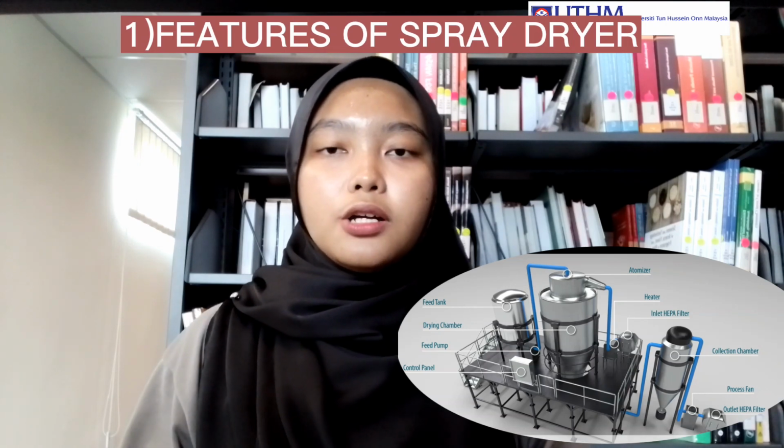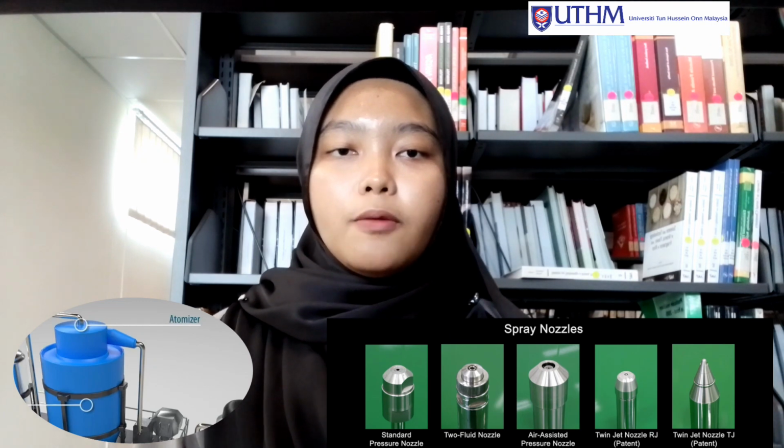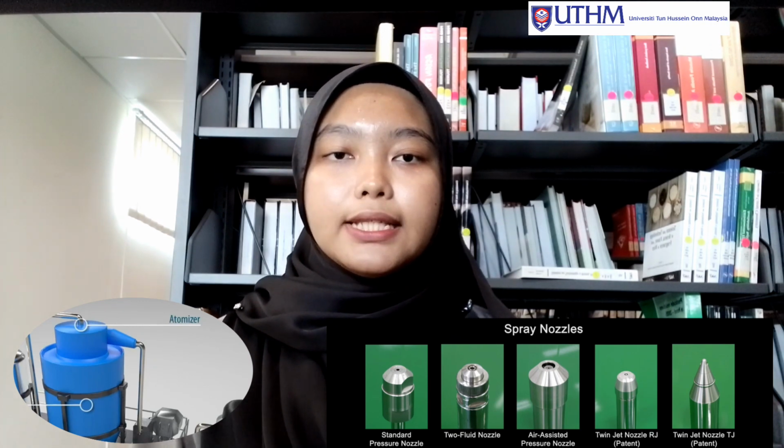AW220059. The first thing that we should know about the spray dryer is its features. The spray dryer has a feed pump. The feed pump transports the feedstock from the feed tank to the atomization system and spray nozzle. The spray nozzle controls the feedstock flow and uniformly distributes atomized droplets into the heated drying chamber.